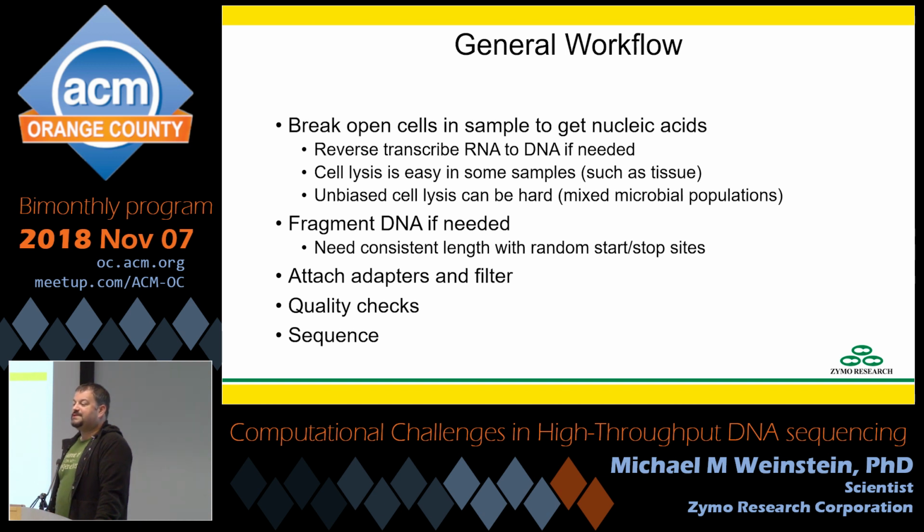Occasionally, cell lysis is not so easy. So a really good example of this is trying to break open all the microbes in a sample. Bacteria are extremely diverse. Some bacteria, if you look at them funny, they'll essentially pop. Some bacteria, you can freeze thaw them repeatedly, and they come back to life.